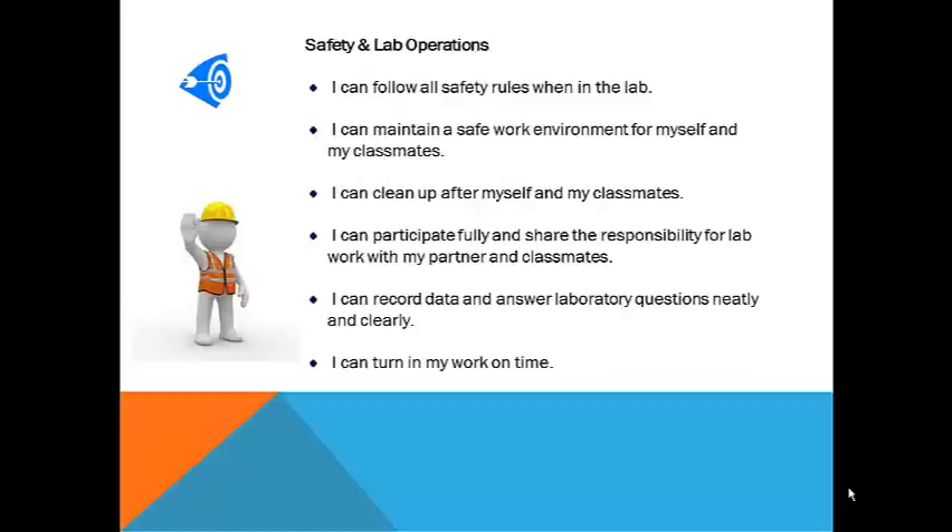Working safely in the chemistry laboratory is a priority. By conducting yourself responsibly and preparing ahead of time, you will be able to conduct experiments without hurting yourself or others. Experimentation is a vital component of science and your teacher wants you to get the most out of the lab experience that you can. Get ready to start — this is going to be fun!